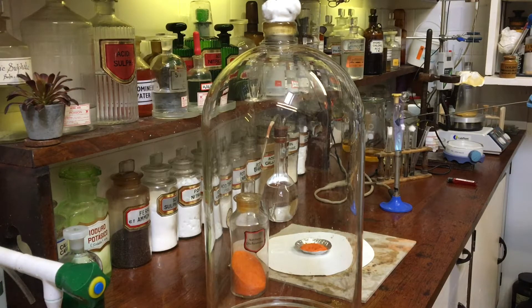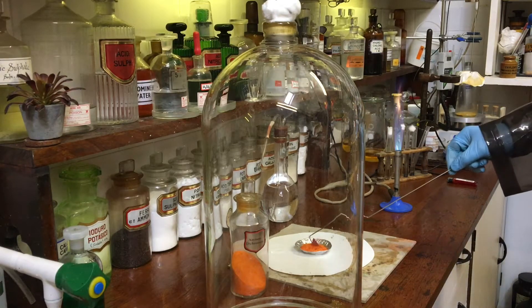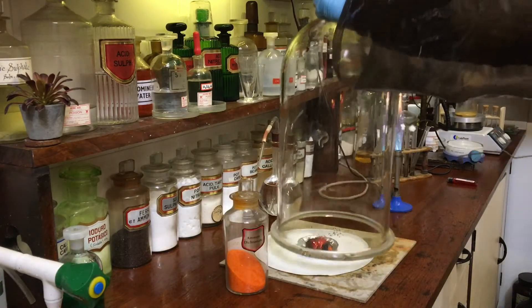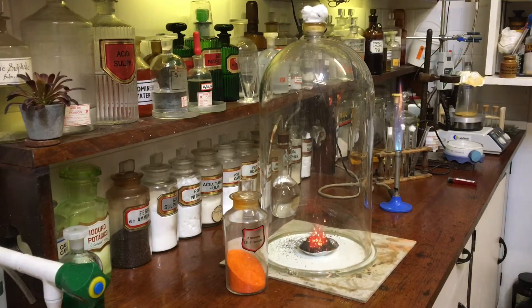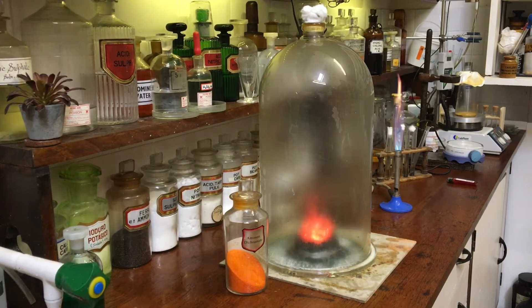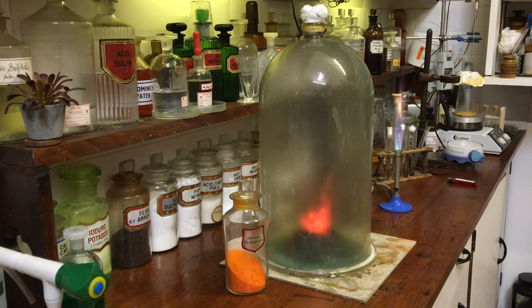I'm heating up a deflagration spoon, putting all my safety equipment on, and we heat it up enough that the thermal decomposition will continue all by itself. As you can see, as it does go on fire it produces a lot of heat and sparks and water, and you can see that it's forming a lovely voluminous ash — a green ash, chromium 3 oxide.